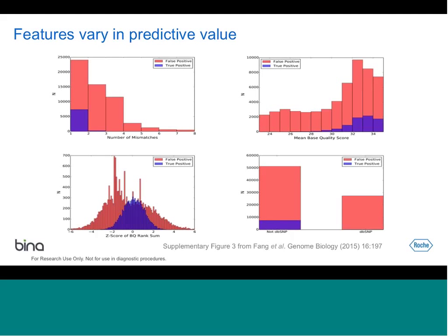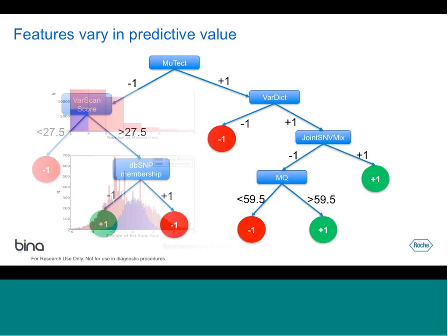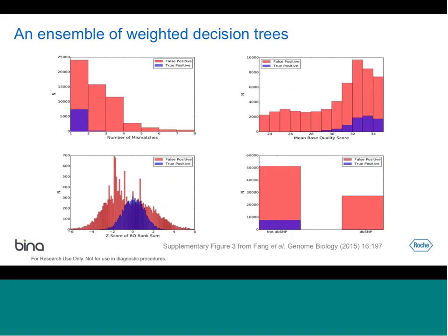Now, if you look at the number of mismatches that is 2, the ratio goes from 3 to 1 to something, by eyeballing, like 10 to 1. And when the mismatches go to 3, 4 and 5, there is essentially no true positive. Everything here is a false positive. Basically, it's saying that if you have a variant call, but all the reads have more than one mismatch, you are likely to see a misaligned read instead of a true mutation.